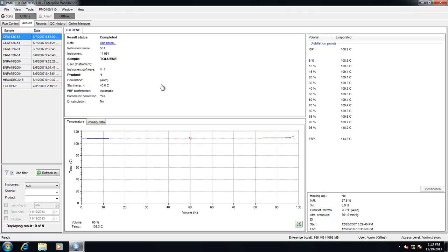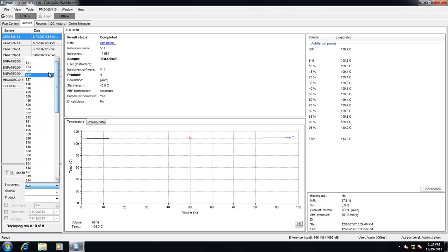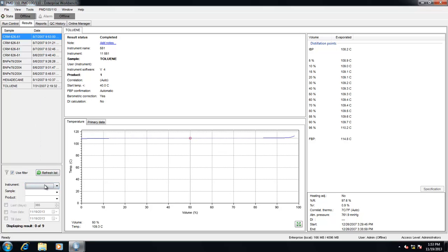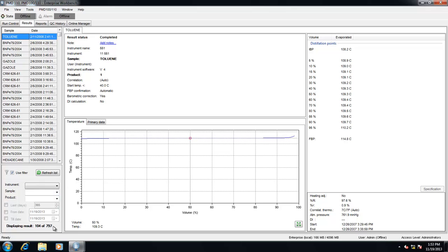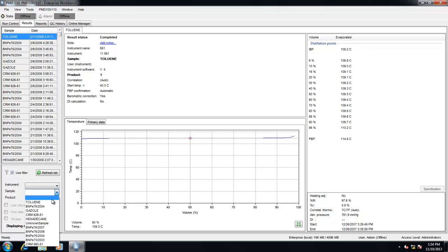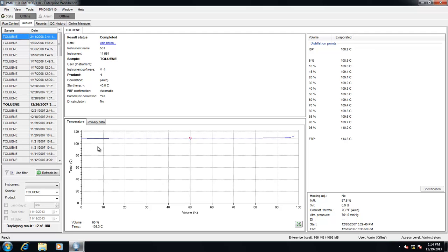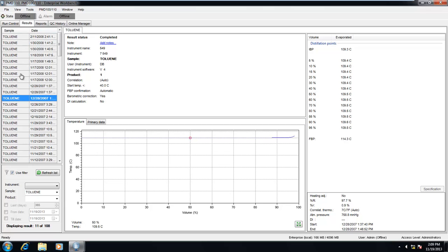Now let's take a look at filtering by sample type. IRIS has the ability to view all results for all instruments on the network for a particular type in which workbench is open. By not selecting an instrument in the instrument drop-down and hitting Refresh List, we are back to viewing 797 results — all results for all instruments of this type on the network. If we wish to filter these results by a specific sample type, simply use the provided drop-down box by selecting or typing in that sample type. You'll notice that IRIS recognizes the characters typed and eliminates any data that does not match our criteria. By hitting Refresh List, you'll notice we're only viewing results of that sample type.